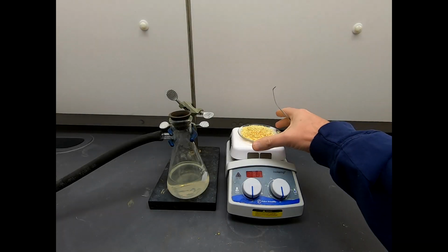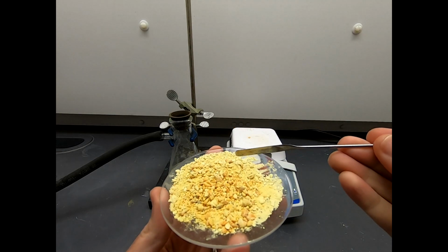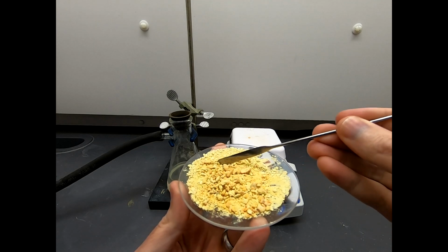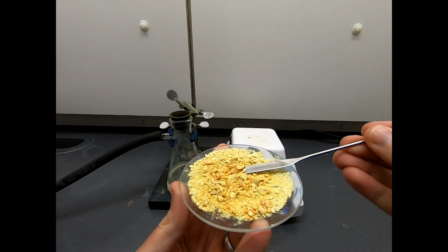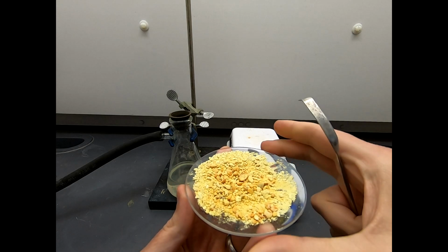Okay, well, this is back in the hood. Here is the product. It's been spread out on a watch glass. It's dry. You can see there are some bigger pieces in there, but I'm less worried about the bigger pieces from a purity standpoint. It's more that bigger pieces can trap moisture, so it takes a little bit longer to dry. This is dry now.